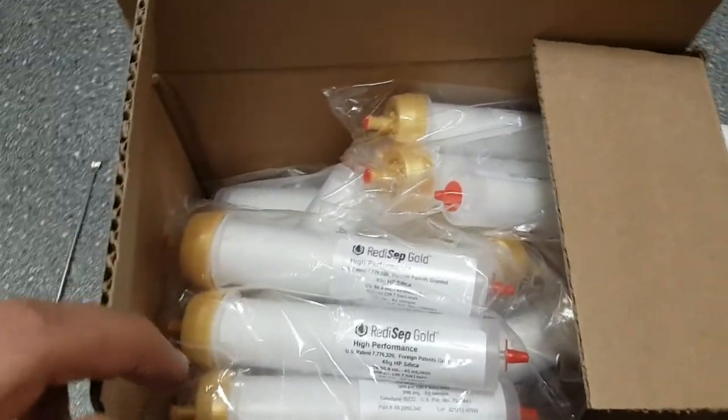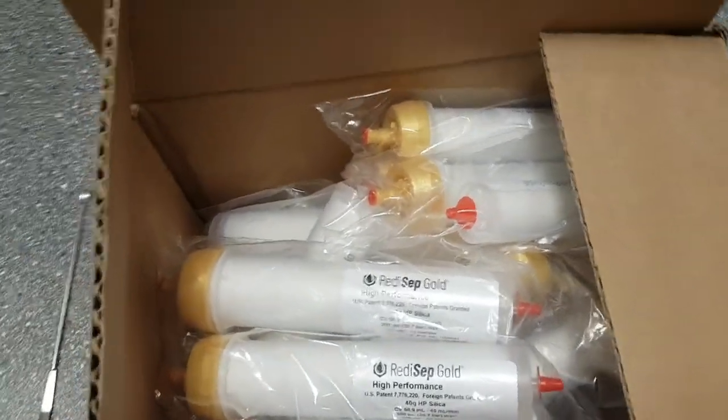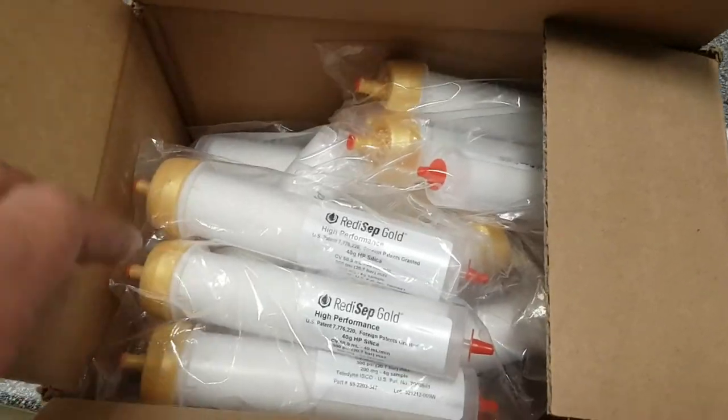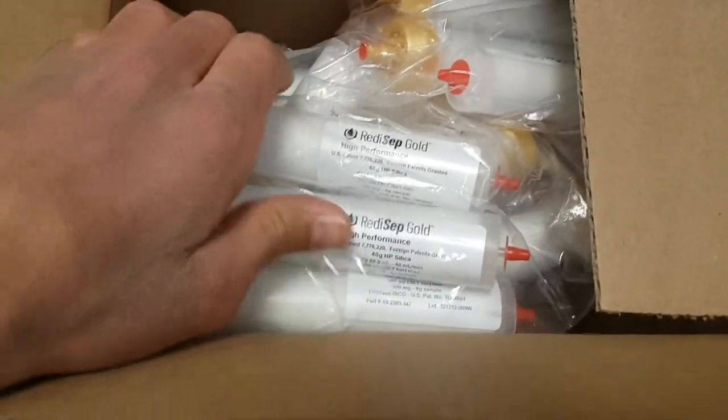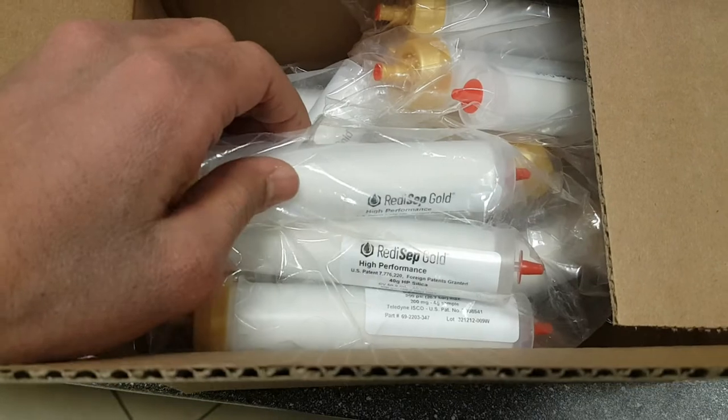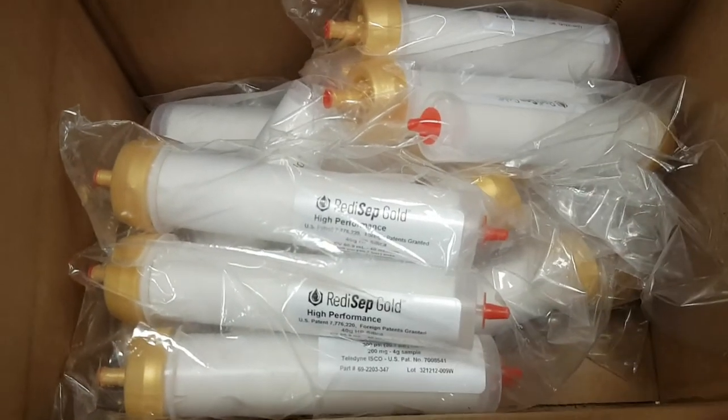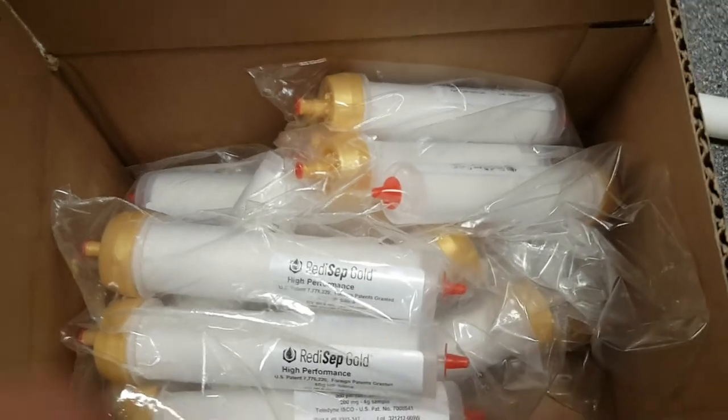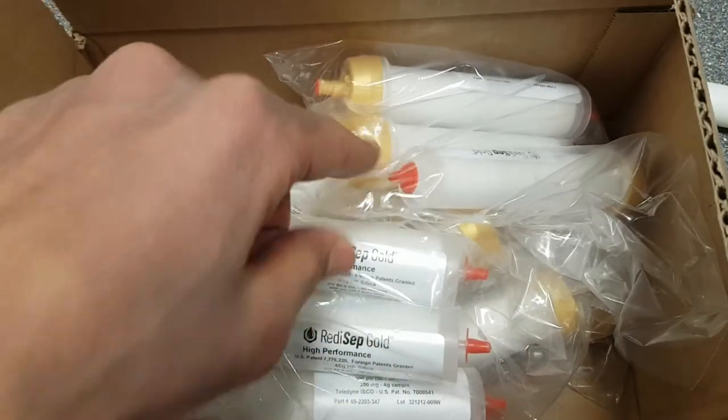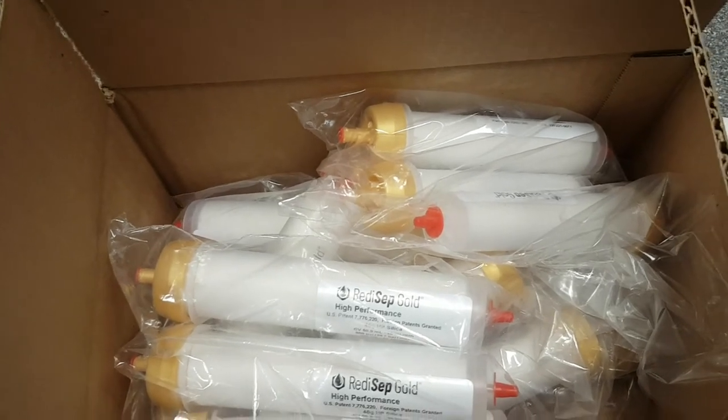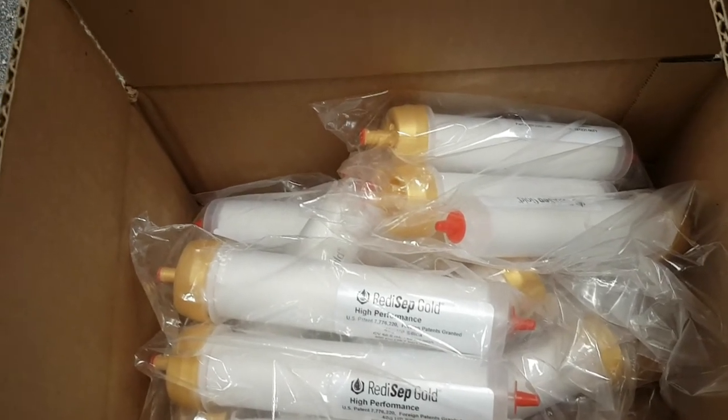Based on the amount that you used here, how much of your plant material, and the complexity of your mixture, you can choose the suitable column that will be more practical for separation. There's a variety of columns, and each column has a range of amounts that you can load it with.